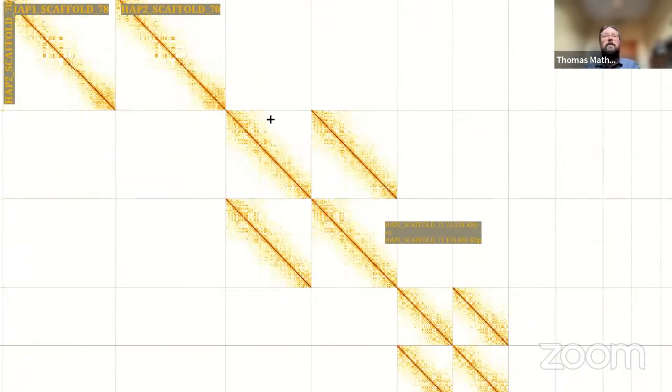There's some obvious areas we'll go back to. Here at the beginning of the map is where we have our microfinder ordered content. So these are the additional candidate microchromosome scaffolds. And if we look into the other haplotype, there's a bunch of stuff over here as well.